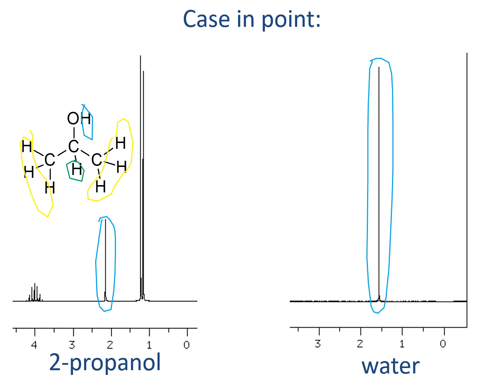And so we'll need to use the ratio of peak heights that we'd expect to see to figure out how much of this signal is coming from this molecule and how much of the signal that we'll see in the isopropanol altogether is actually coming from water as well. If we can figure out how much is coming from each, we can figure out overall what the ratio is of 2-propanol to water.